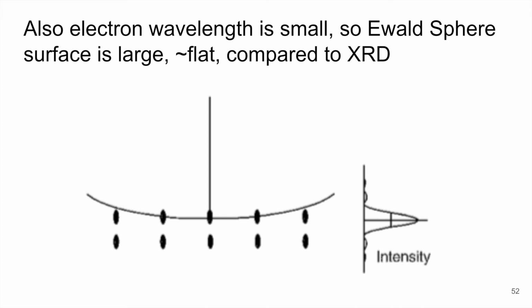So I recommend you go back to when we talked about Ewald sphere. I made the comparison between electron diffraction and X-ray diffraction. And you can see that I have some images there showing the relative size of the Ewald sphere that can be helpful in that relationship.